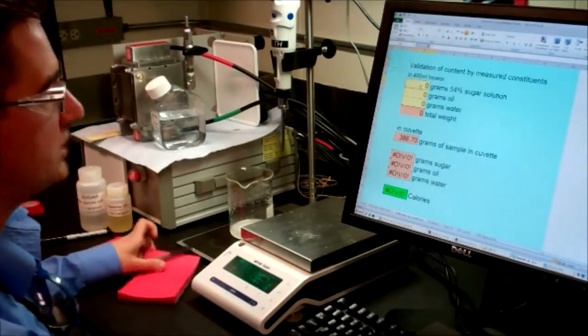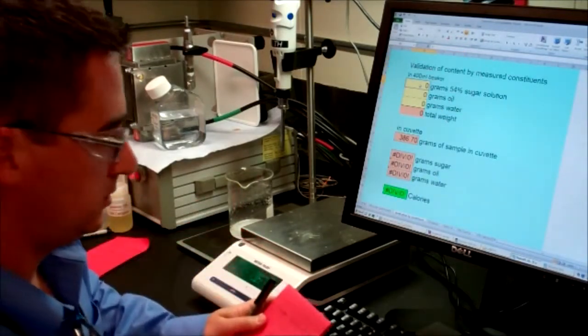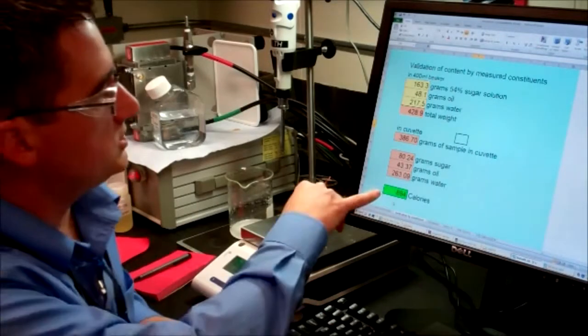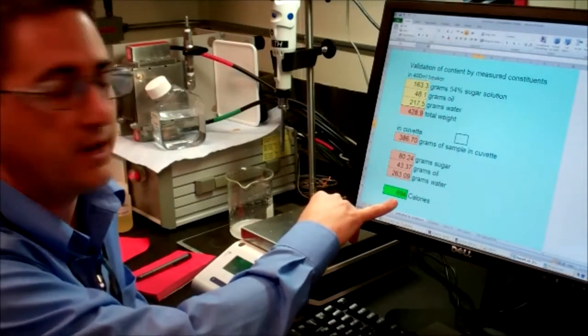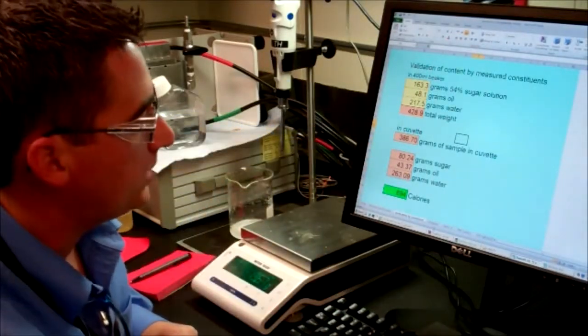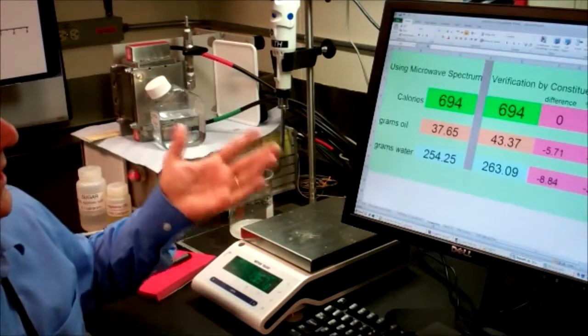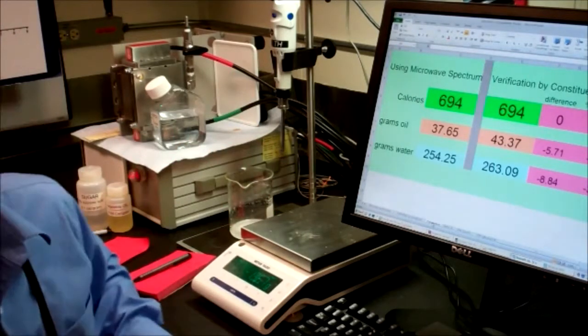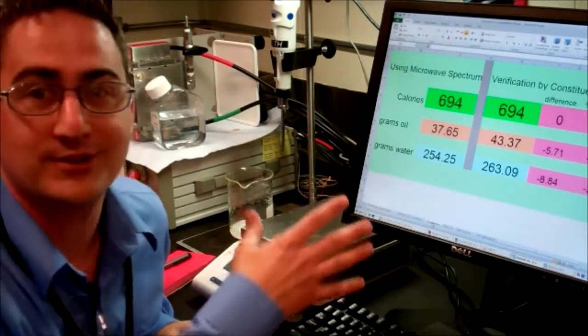Now we're going to put in those numbers that we put into the beaker. Okay, so you can see here we get an estimate of 694 calories. That's what we put in the beaker and then it tells us how much we actually poured into that cuvette. And then what we have is a comparison where we can see we're exactly on, which is a rare occurrence.